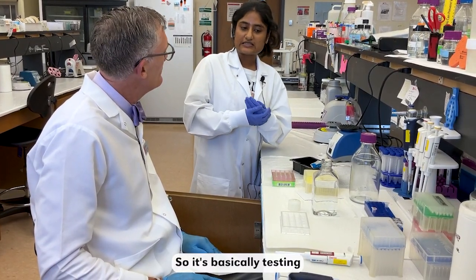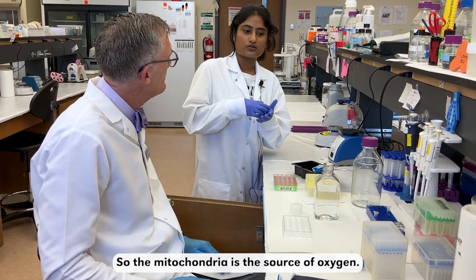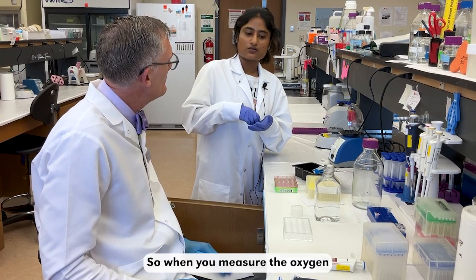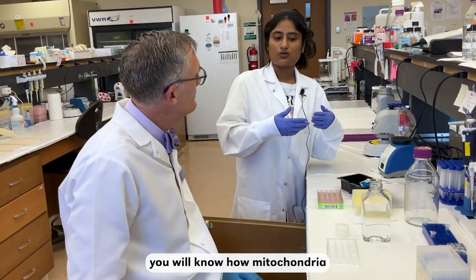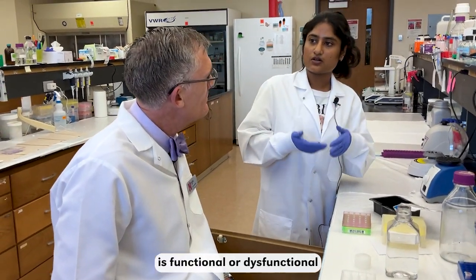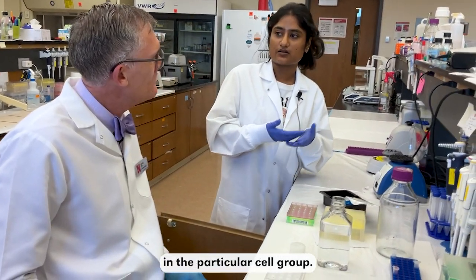So it's basically testing the mitochondrial function. The mitochondria consume oxygen, so when you measure the oxygen consumption, you will know how functional or dysfunctional the mitochondria are in a particular cell group.